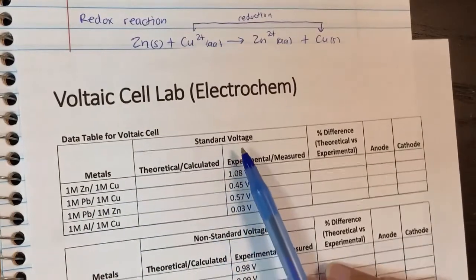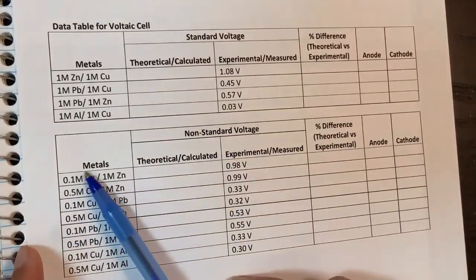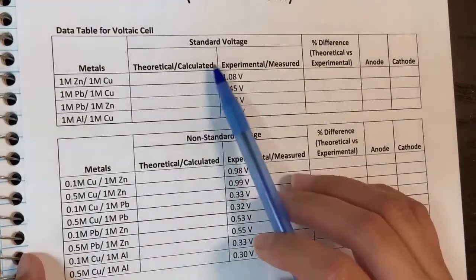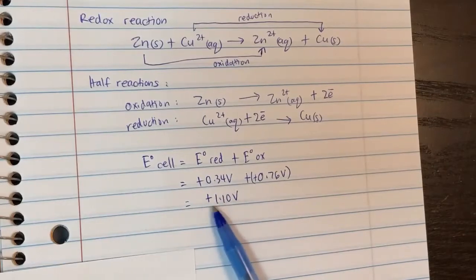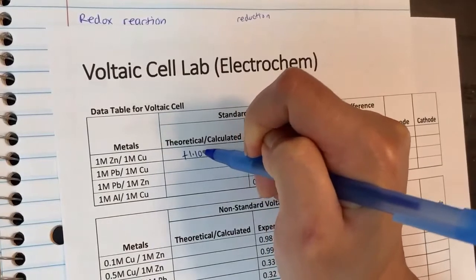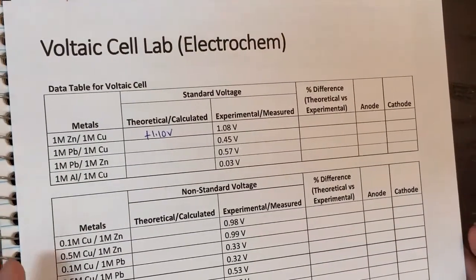Remember, standard is 1 molarity. Non-standard is when the molarity is no longer just 1 and 1; there are different molarities here. So what we just did was calculate the theoretical value, or calculate it from the value from the table. This 1.1 goes here. Okay, so that's our first cell here.